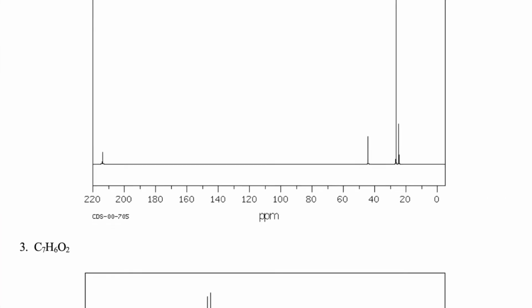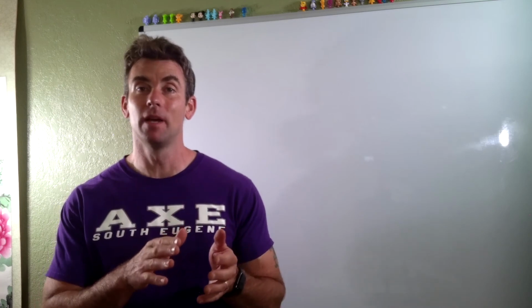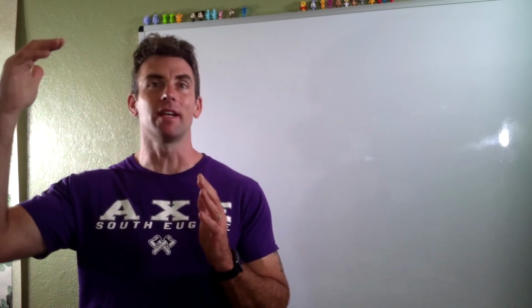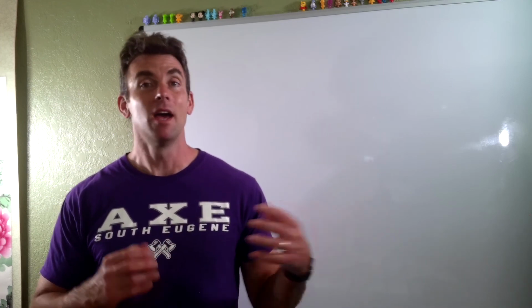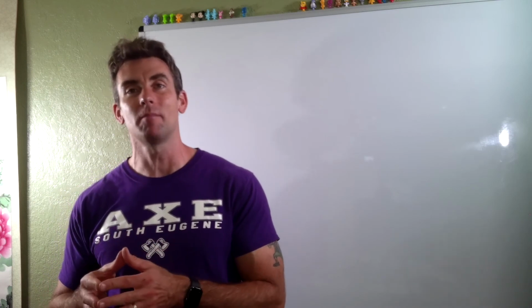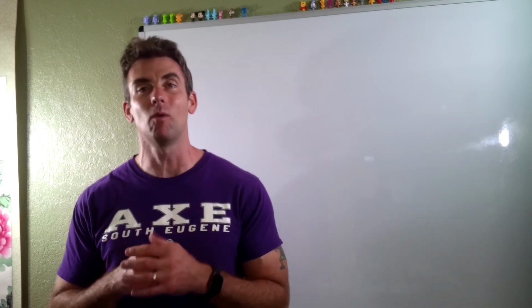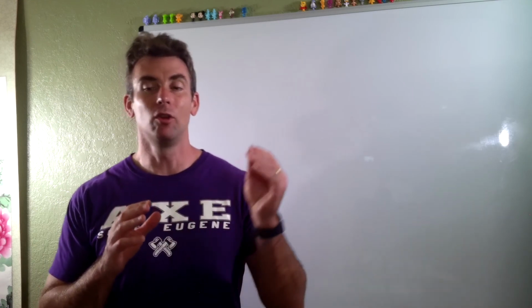Handout number 5 is where you're going to be asked to do something that you're regularly going to do in organic chemistry, and that is to take a spectrum. Generally, once we're at the end of second term, we're going to know all the different spectroscopies and we'll end up with a bunch of different spectra that we're then able to use to suggest a consistent structure. In this particular beginning activity, what we're going to get is the molecular weight of a compound, which is going to allow us, based on the table of molecular weights, to figure out approximately what atoms are in a molecule. And then, based on that, to give some sort of structure, looking at both the chemical shift and the number of peaks in a spectrum. So give that one a try, and if you have questions, ask me.